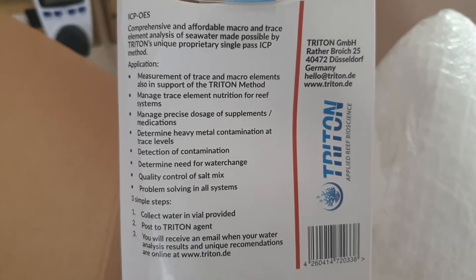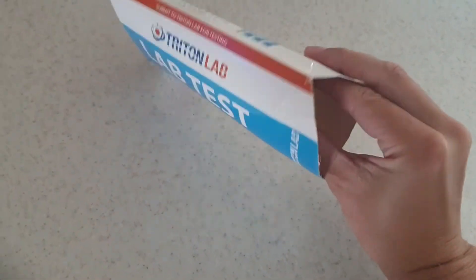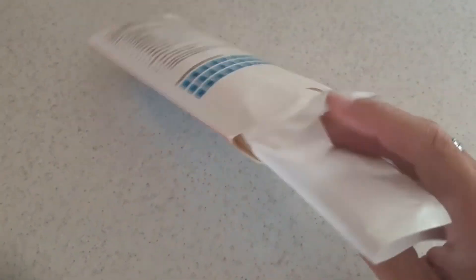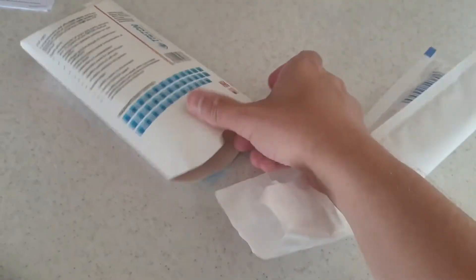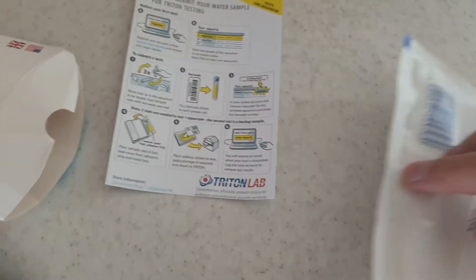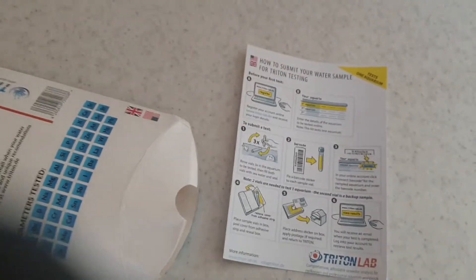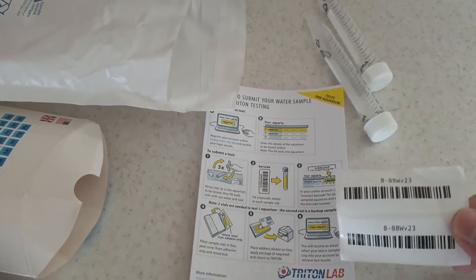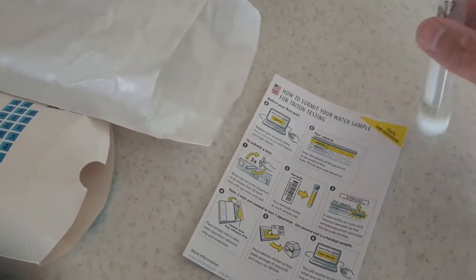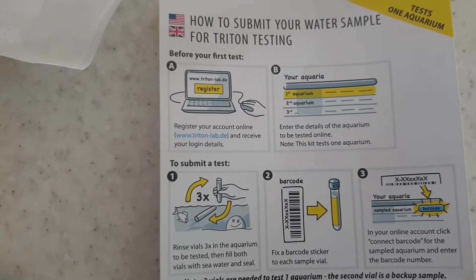We've got the instructions on here as well. Let's open this up and see what we get inside. There's the bag — that's what we're going to be posting it in. And what else do we have? The instructions on exactly what we need to do, and inside the little bag we have the vials, plus the little barcode stickers.